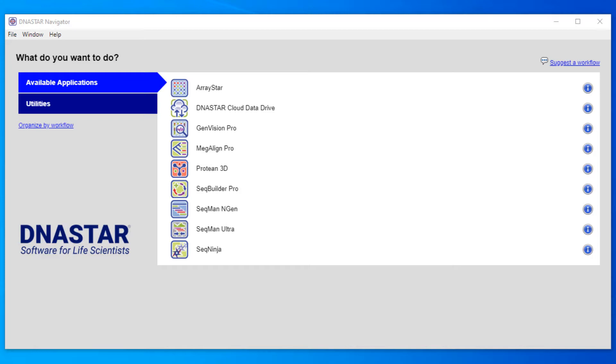I've created this video to show different ways of loading files into the Megaline Pro application, and I've also created a follow-up video showing the different supported file types that Megaline Pro accepts. There are many options for loading files into our software.